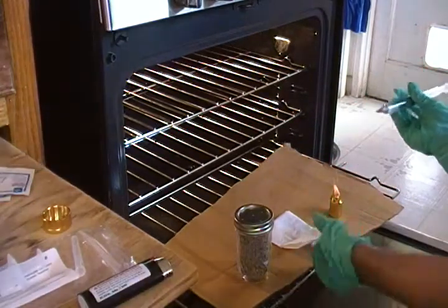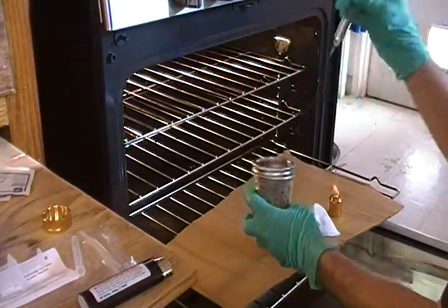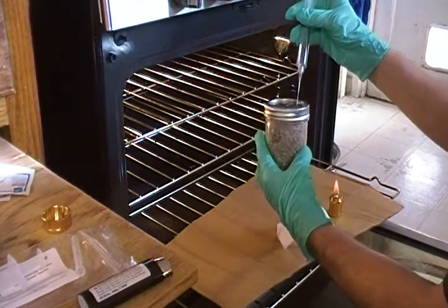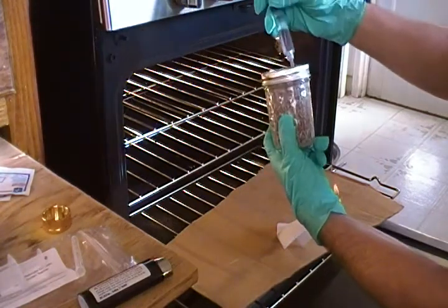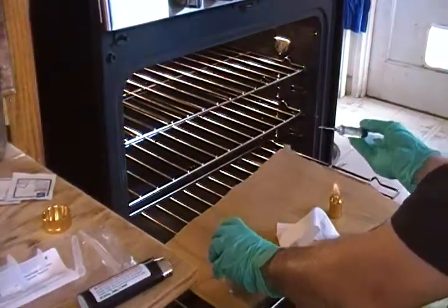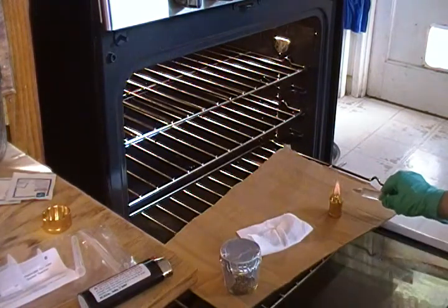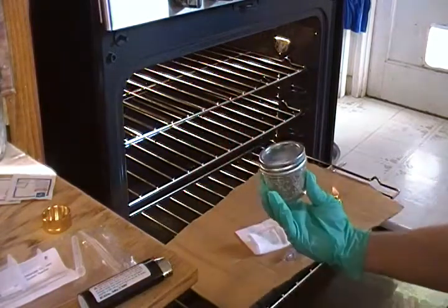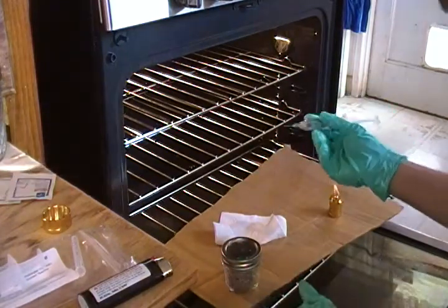I'm ready to inoculate my first jar. Make sure the needle is cool, bring it to the edge of the jar, and put a couple drops in there at the edge where the glass meets the substrate. After each jar, you must sterilize your needle again so you're not contaminating the next jar — that's mandatory. While it's cooling, remove the foil on the next jar, wipe it down, and let the needle cool.